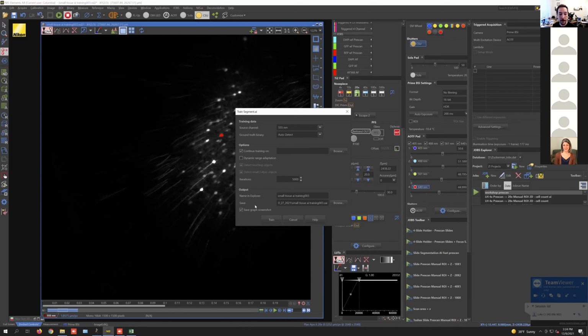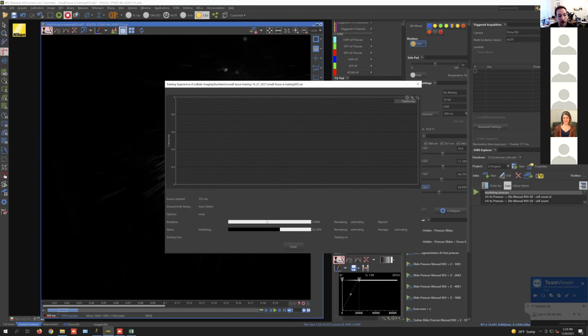We just need to give it a name, and it'll save a screenshot. So this is if I click train now, it'll start to train the network. And we haven't really got time to get too much into this, but it's learning that from the image it's given what masks it should present. And so we've got the masks already given to it, the ground truth data. And so we can, over time, train the network and see how different its results are, and slowly converge to a point where it's creating masks that are very similar to the masks that we gave it.